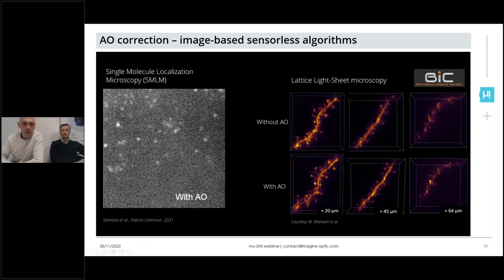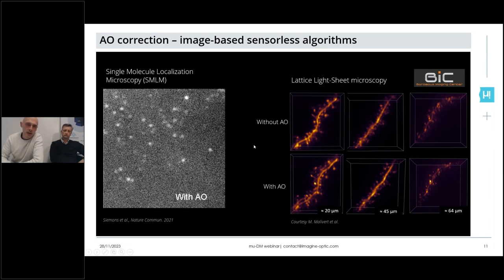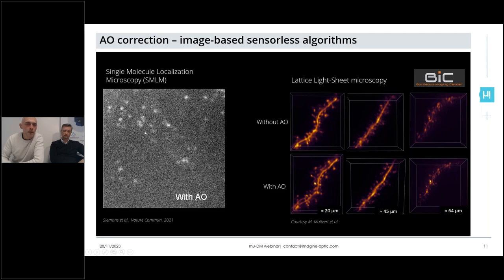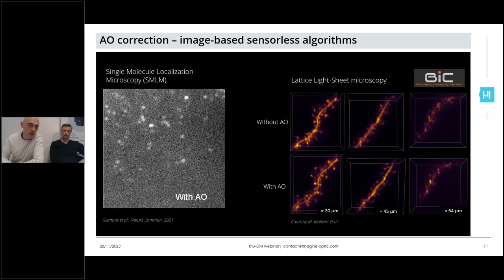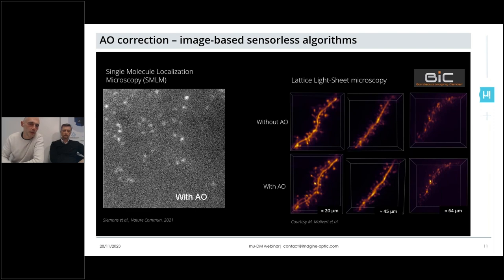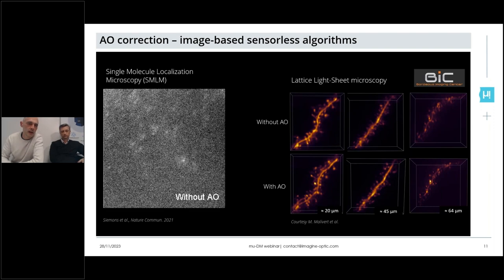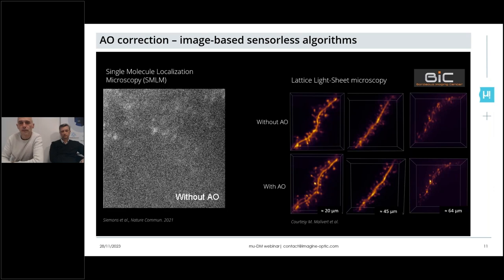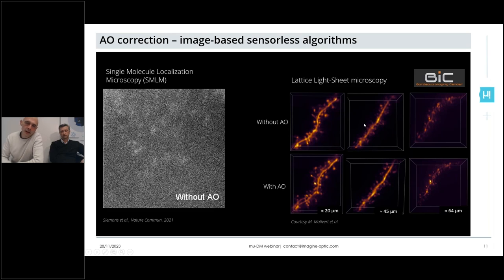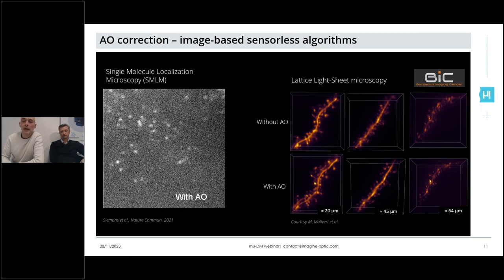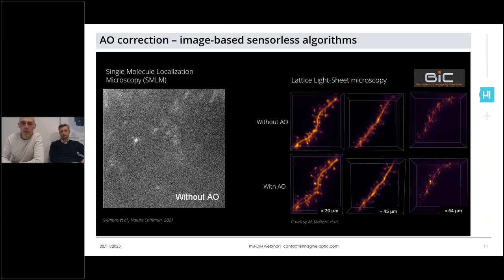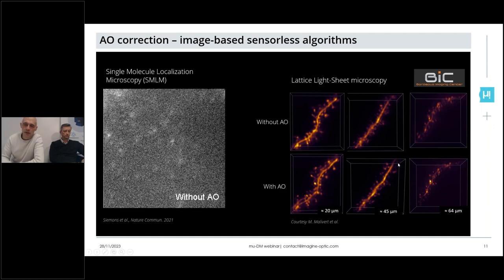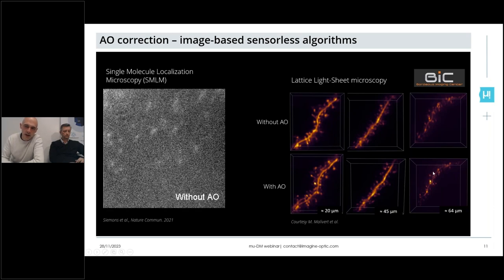Here are a couple of examples done with collaborators using our set of adaptive optics components. On the left, a movie shows the typical point spread function acquired through single-molecule localization microscopy: without adaptive optics you see a strongly distorted PSF, and with adaptive optics the circular shape of a good PSF is retrieved, which strongly increases the localization precision. On the right, adaptive optics integrated into the detection path of a lattice light sheet microscope shows the effect of aberration correction in depth on brain organoids, with increase in signal and resolution particularly for small structures like dendritic spines.